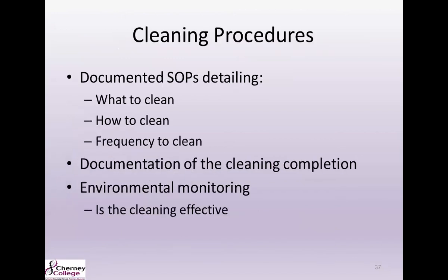So first and foremost, you're going to want to keep your equipment clean. Have SOPs detailing what to clean, how to clean it, and the frequency of cleaning. And obviously you want to have that documentation of cleaning for traceability. Make sure that you're doing enough cleaning by looking into environmental monitoring, making sure that the cleaning that you are doing is effective.